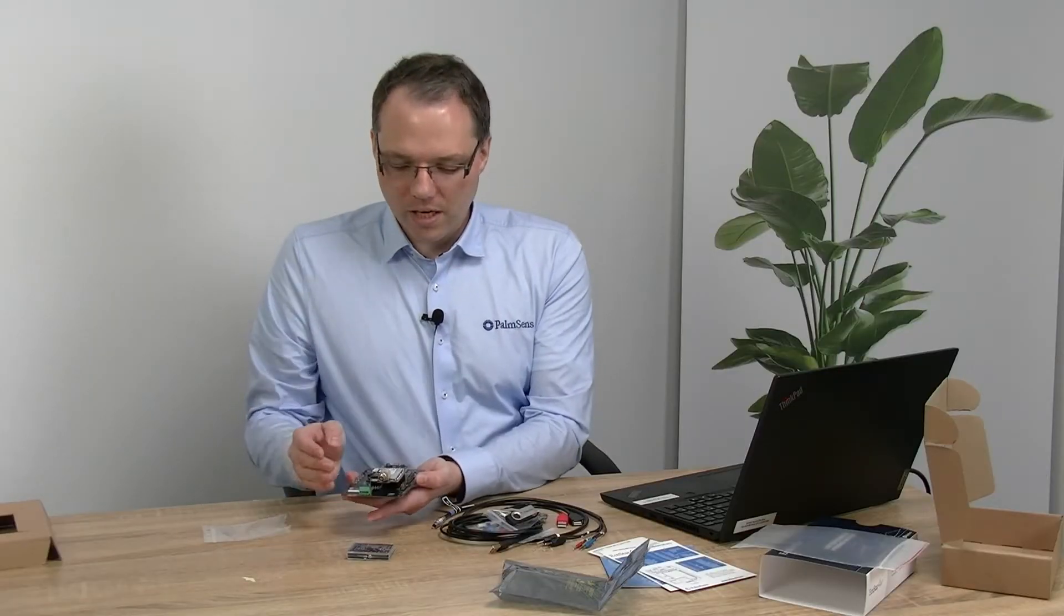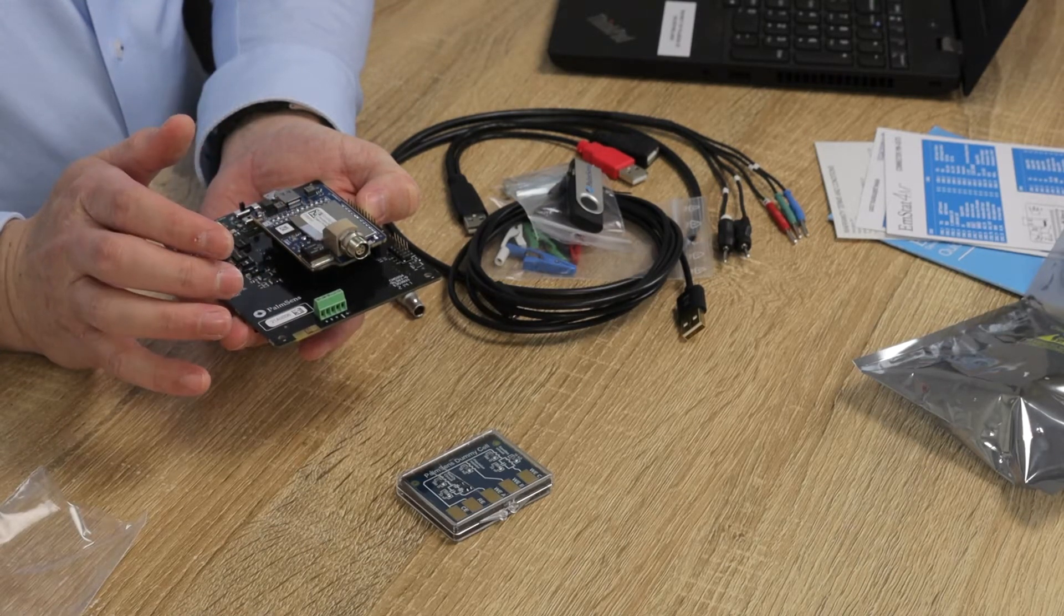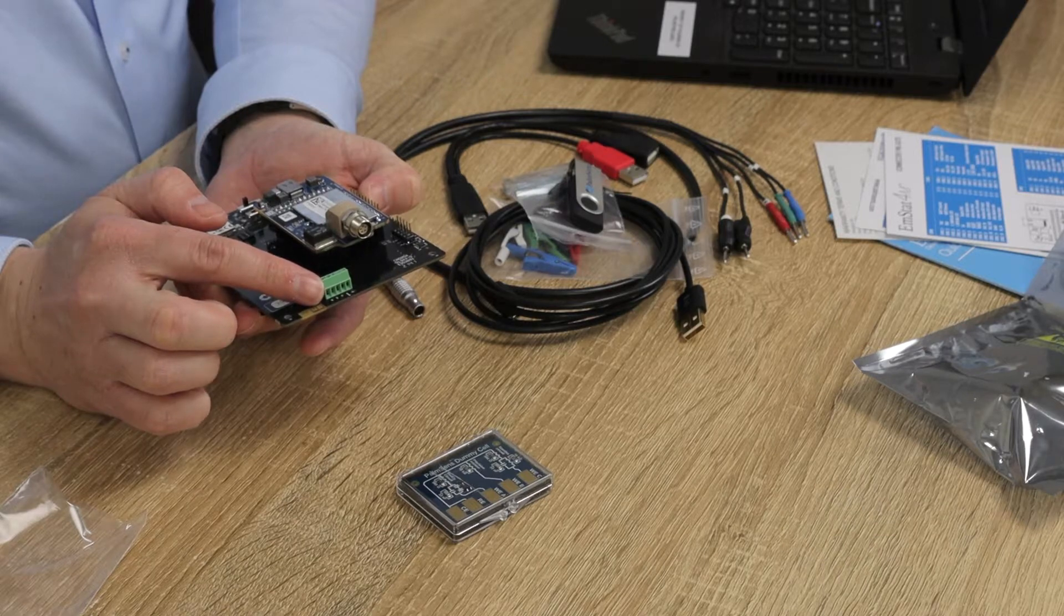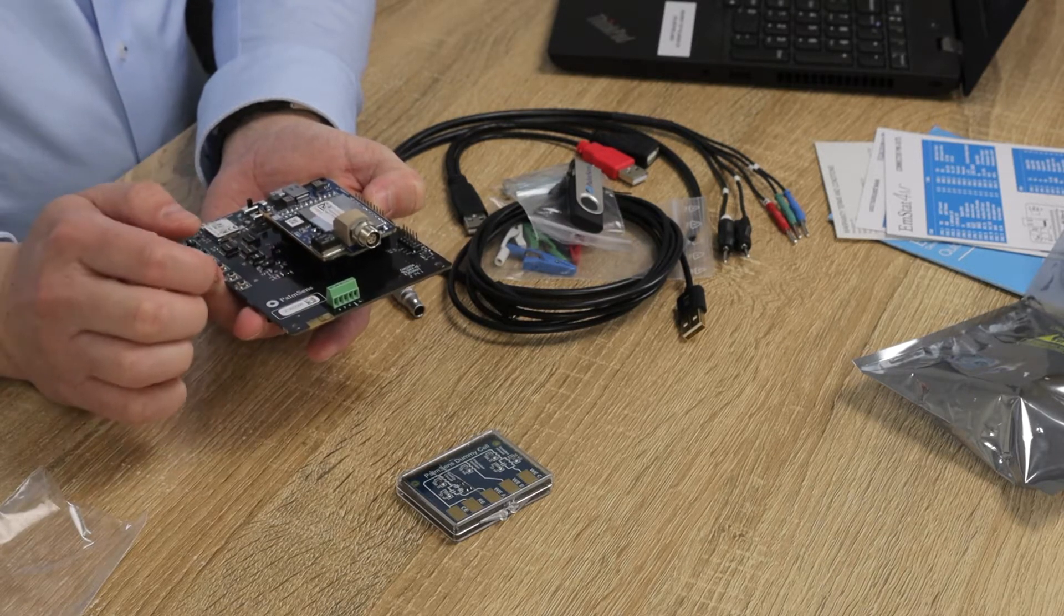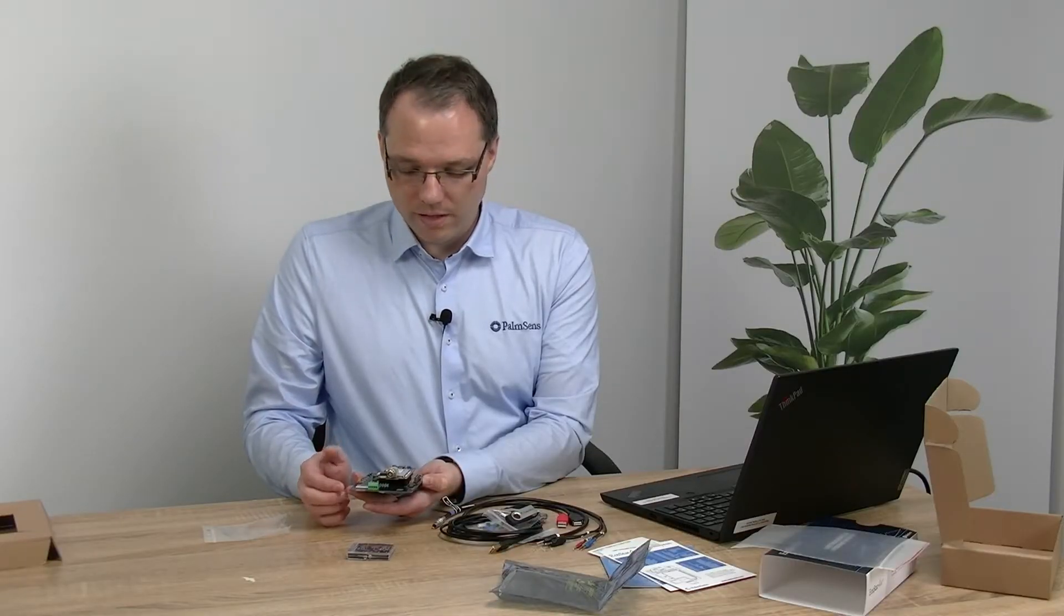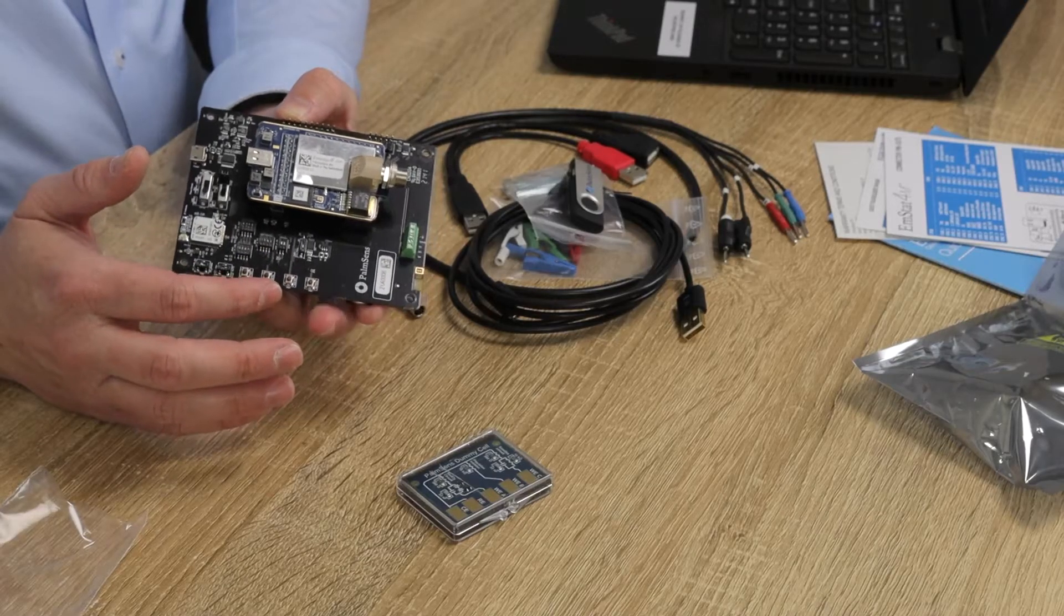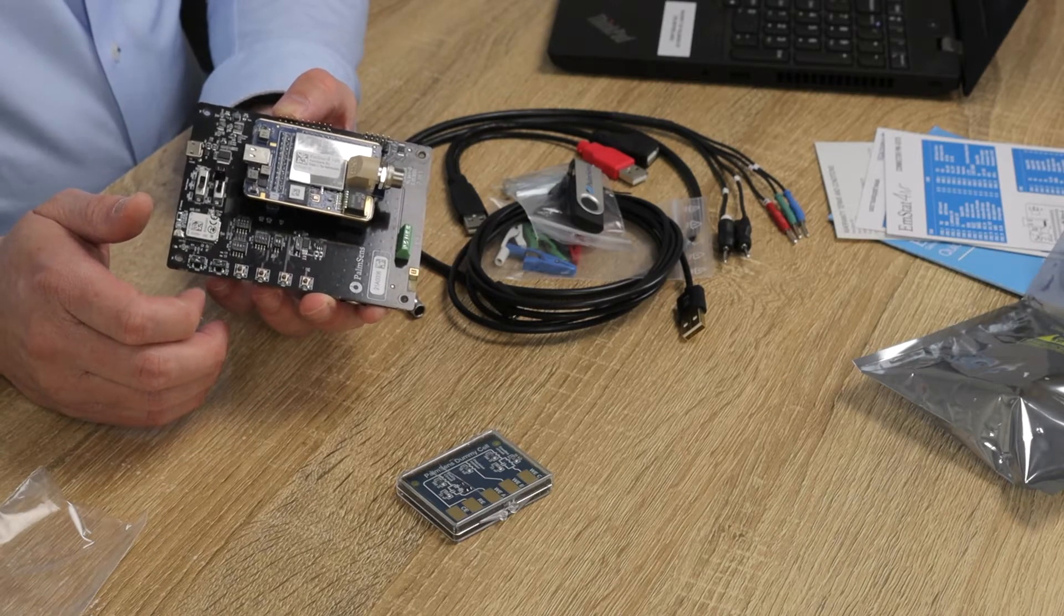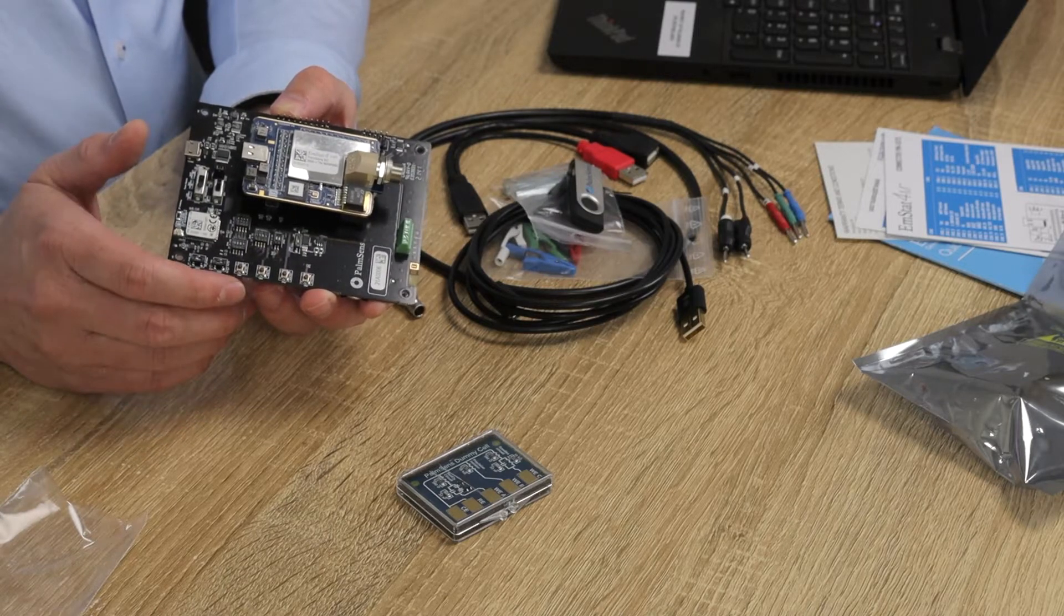You also have a connection for the cable. I will show you that when we do the first test measurement. You have here a screw terminal which is an alternative connection for your electrodes and screw terminals make it easy to handle any cables that you like. It's also easy to connect, for example, an SPE connector to it. There are some push buttons here that allow you to put the potentiostat module into download mode or reset the board or reset the Bluetooth module.